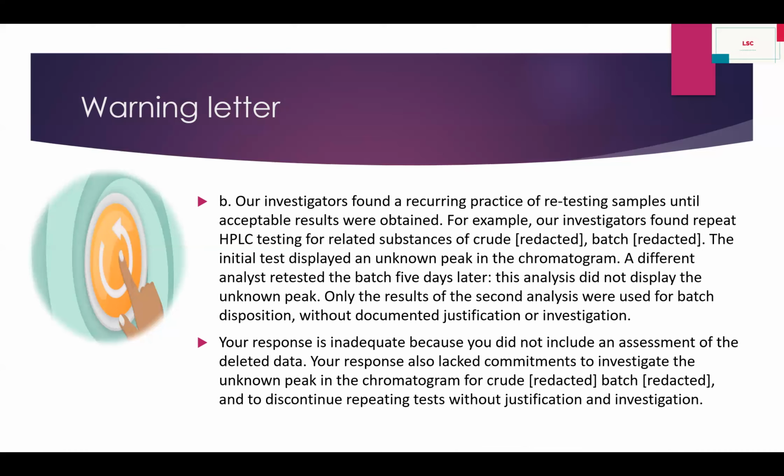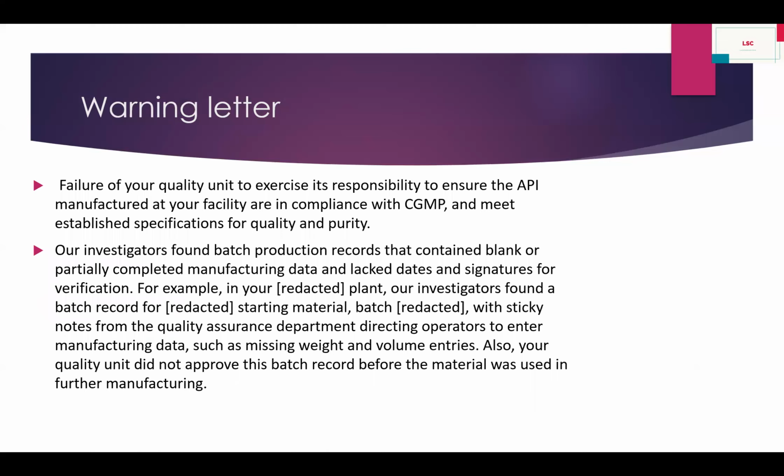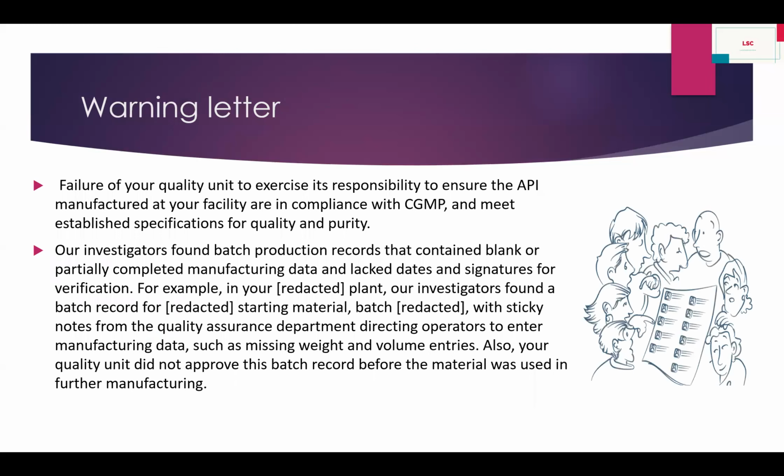Your response is inadequate because you did not include an assessment of the deleted data. So the investigation assessment is not clear. Your response also lacked commitment to investigate the unknown peak in the chromatogram of the batch and to discontinue repeating tests without justification and investigation. So we can't give any justification for this type of work. How we control all these things by our software validation, by our computer system validation, we have to remember, and we have captured it in our risk assessment.